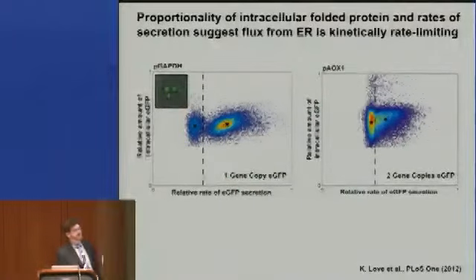So now, by this integrated measure that we can do, where we can look at intracellular content versus our secretion measurements by microengraving, we can actually do one-for-one correlations of intracellular amounts to secreted protein. And what's interesting now is here you can see these two populations that I showed you earlier in pie chart form, now measured at the limit of detection of the measurement for both secreted GFP as well as intracellular GFP. You can see there are two distinct groups that coexist here.